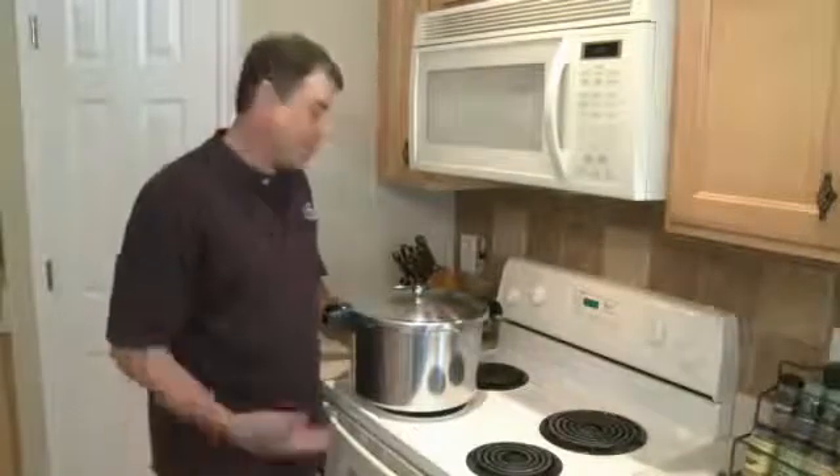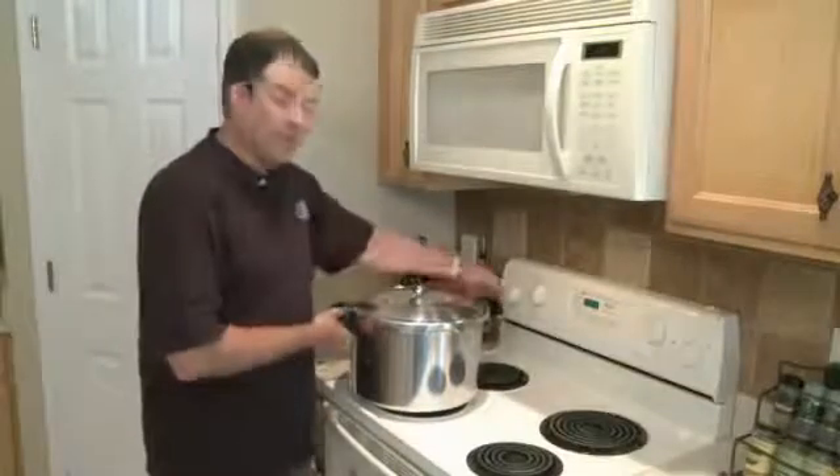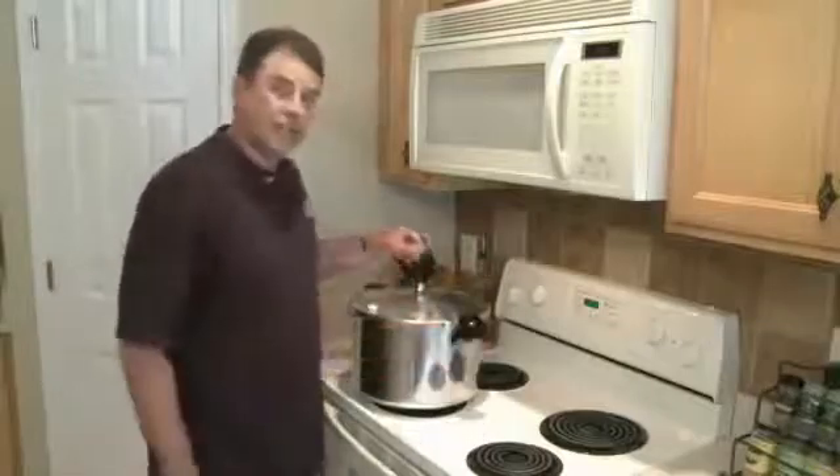I've never ever seen it happen, but just in case you're wondering what the rubber button was. I'm going to turn up the heat and we're going to get this started.